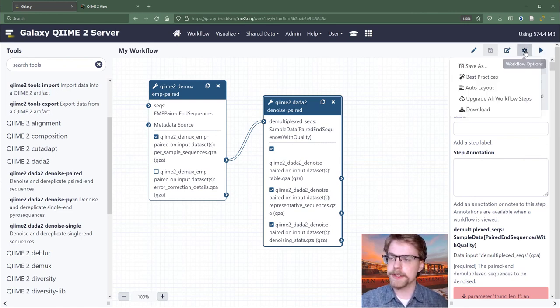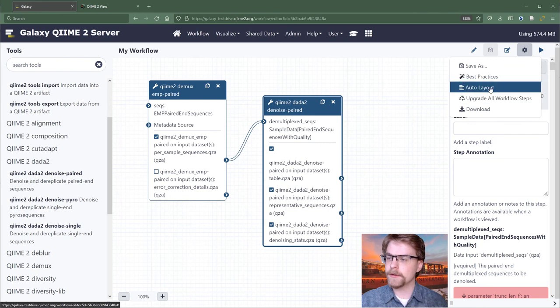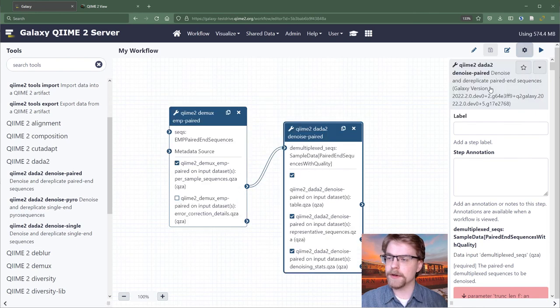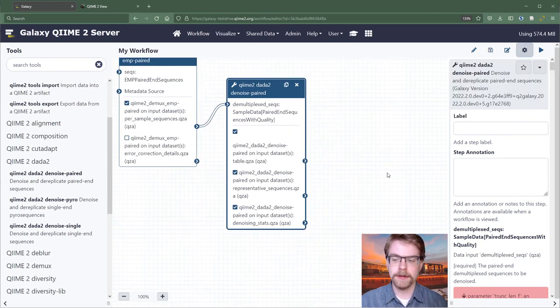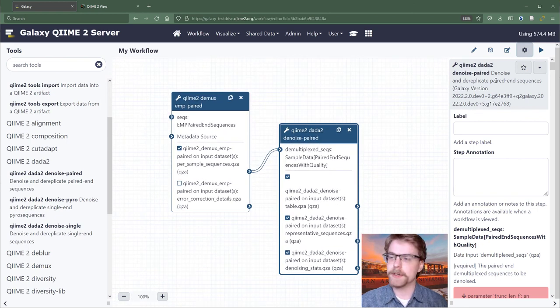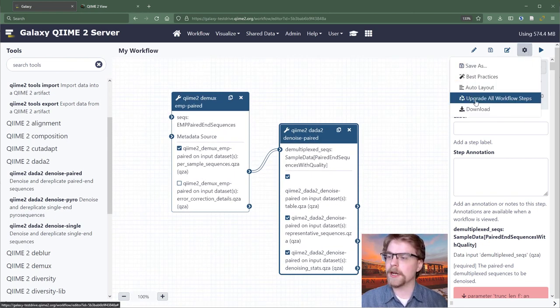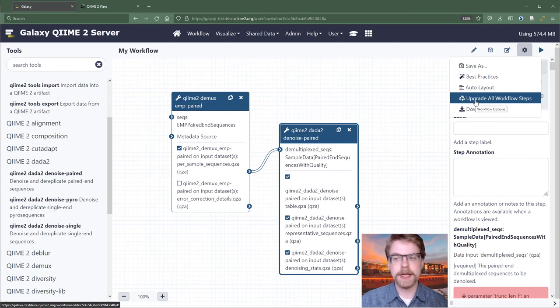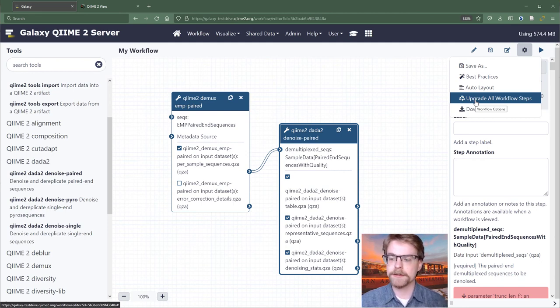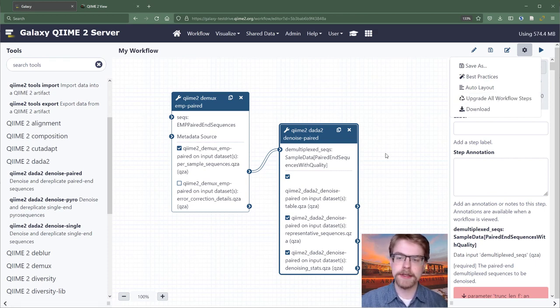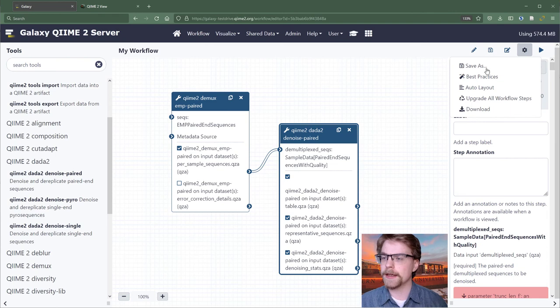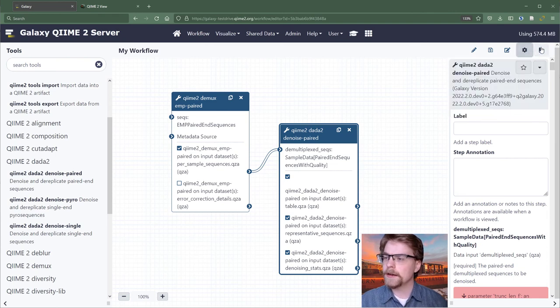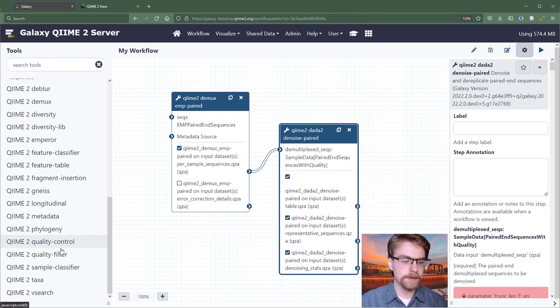You can change options, or you could run it. So let's look at workflow options. We could do auto layout. That's pretty cool. So that tries to make it reasonable to look at. You could upgrade all workflow steps. That's only interesting if your Galaxy administrator has updated the tools in between when you started this and when you actually run it again. And obviously, there's running. So that's a workflow.